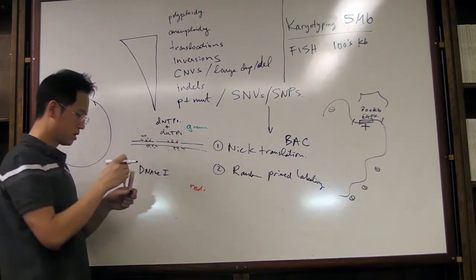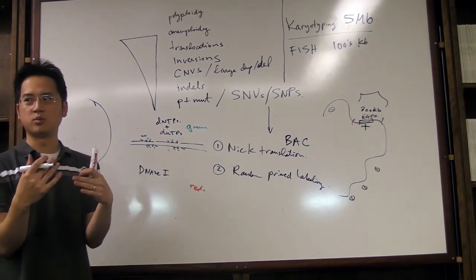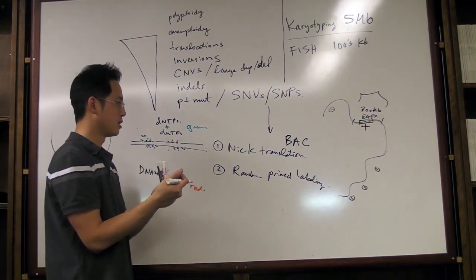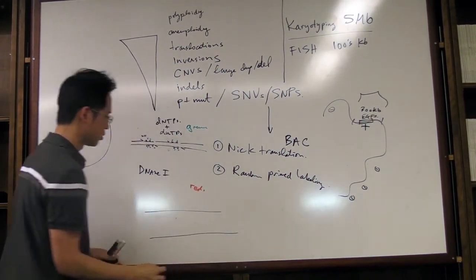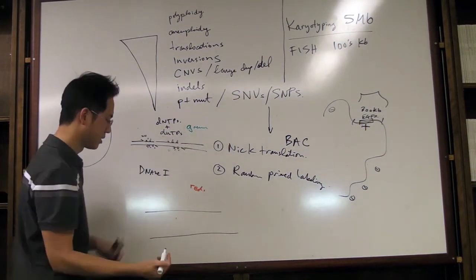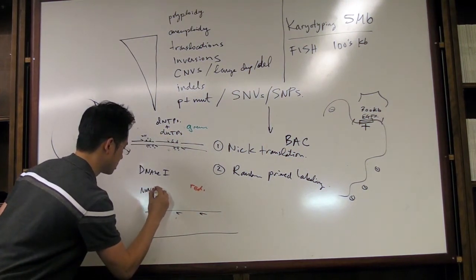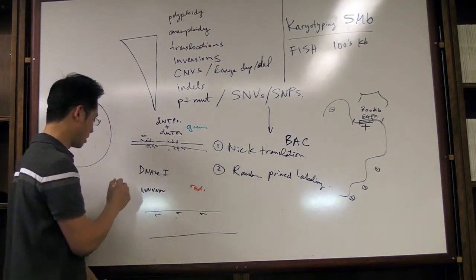So essentially, the DNA is encoded, but then also containing your dye, which will be your probe that you use for the probing stuff. So random prime labeling is a little bit different. What you're going to do is take your DNA template from the backbone, double-stranded, melt it off, and what you want to put into here are random primers, so they're random hexamers. So they're like 6 bases representing all combinations. So you'll have 4 to the 6 combinations of this.